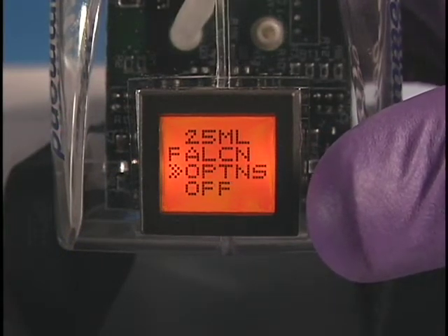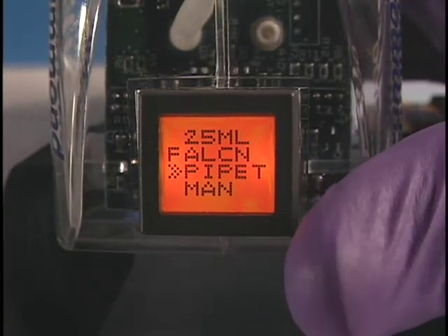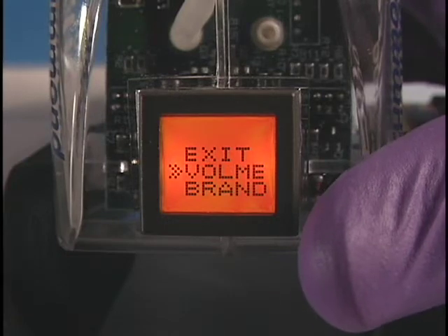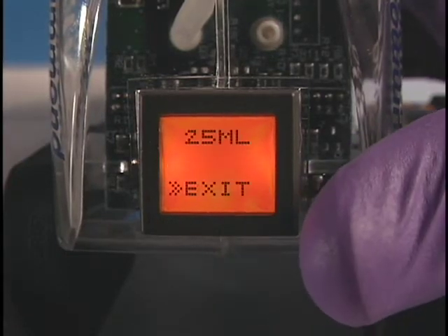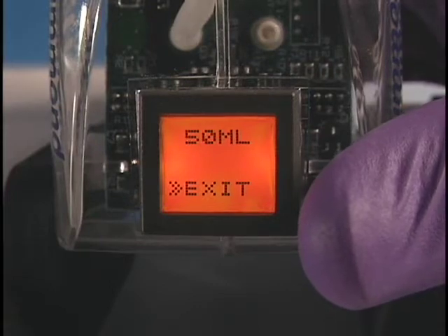Scroll to Pipette and press the Menu button. Scroll to Volume and select. Volume options include 25, 50, 1, 5, and 10 milliliters.